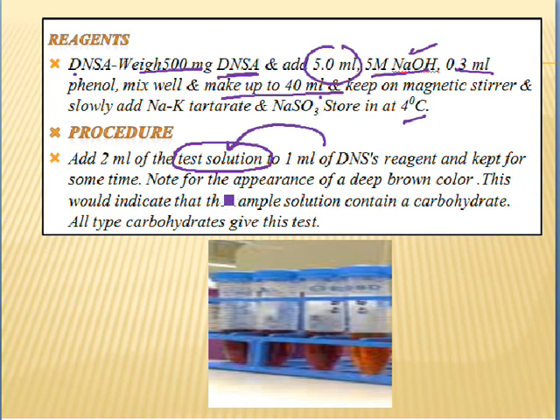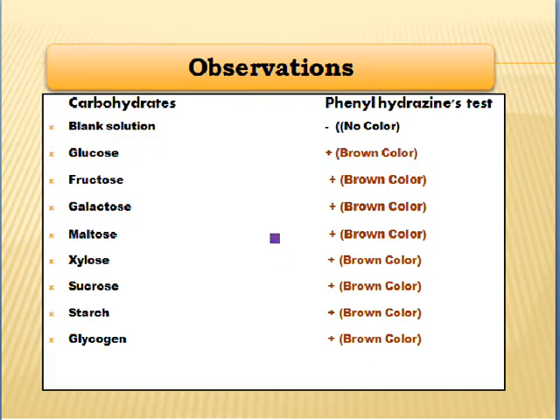We add 2 ml of the test solution to 1 ml of the DNS reagent and look for a brown color in all test tubes. Here is a test tube showing the brown color of the complex. Observation: all sugars give this test, showing brown color — monosaccharides, disaccharides, oligosaccharides, and polysaccharides all give this test.